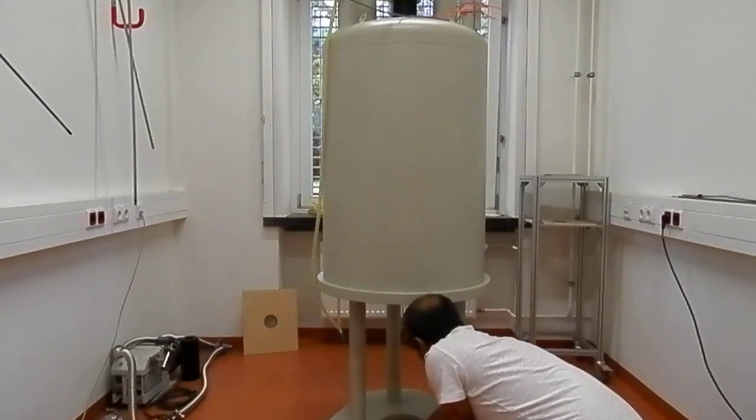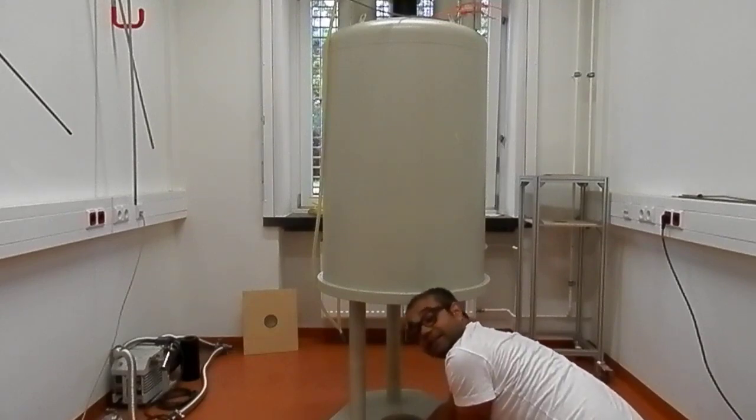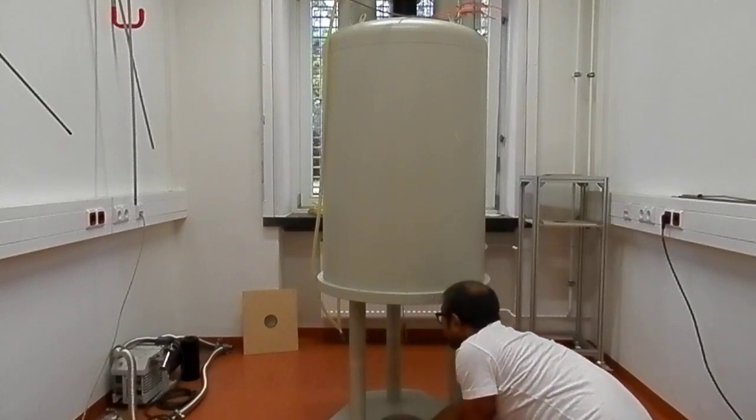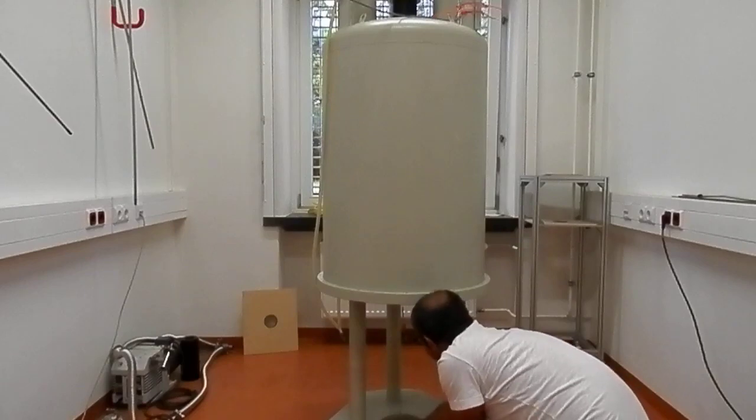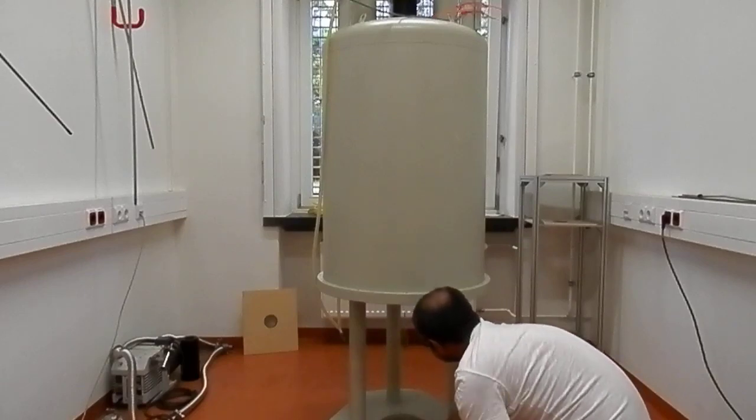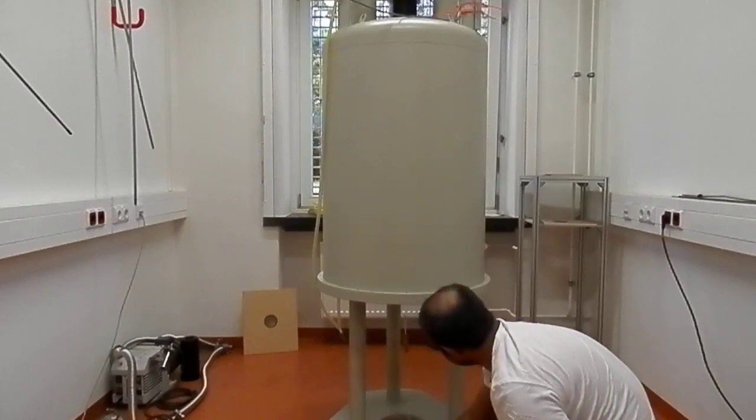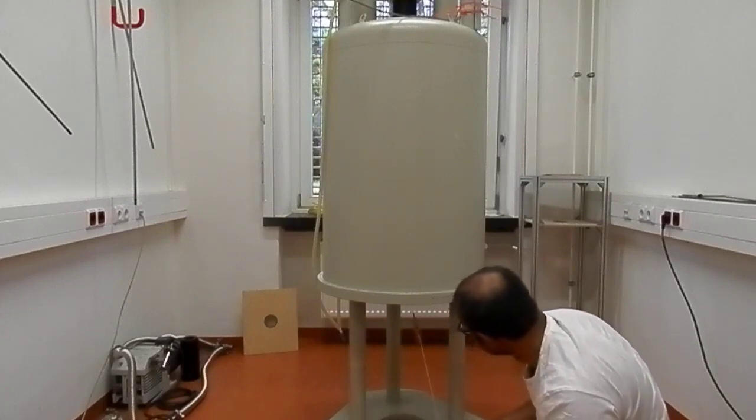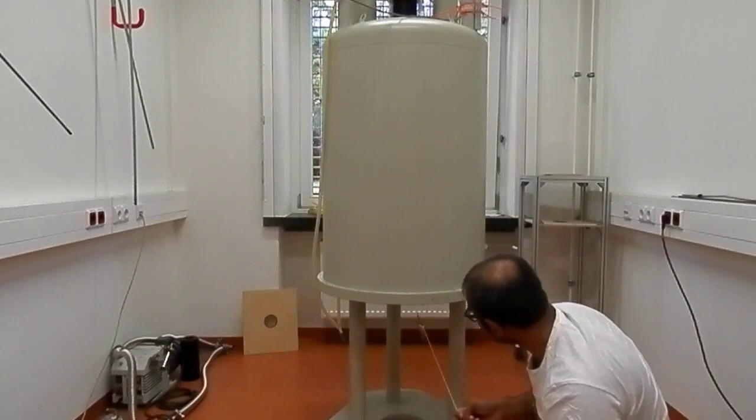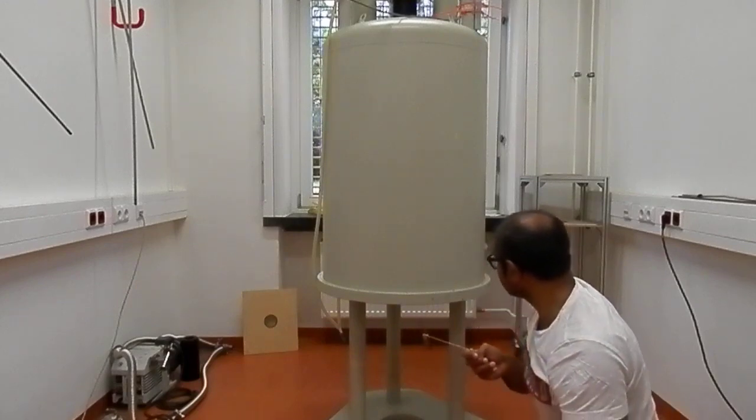That tells you how dangerous it could be to bring magnetic materials close to the bottom of the magnet. Now I can try to bring these things slowly out. You see, it's really bending and bending, and now it will probably not fall down.